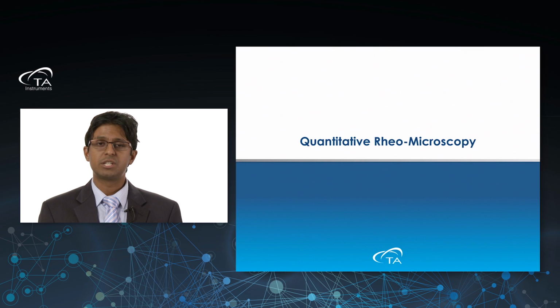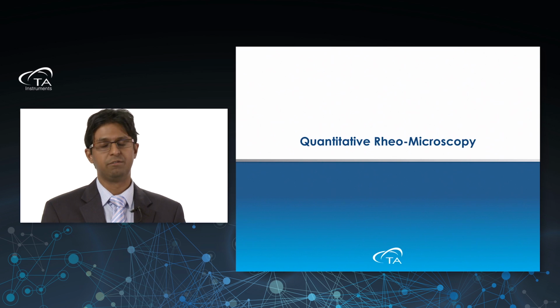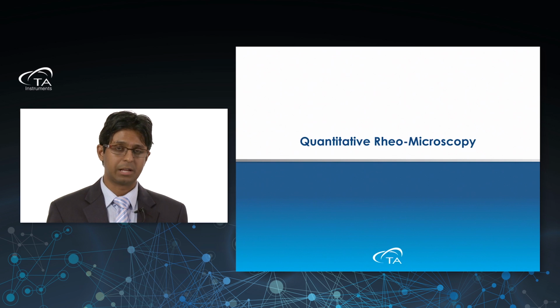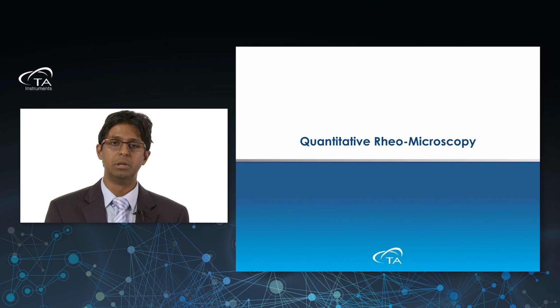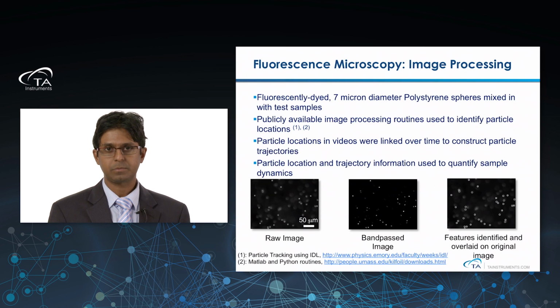In the last section of this talk, I'll talk about how we could do quantitative rheomicroscopy. So previously I showed examples of collecting pictures and videos during rheological tests that can be used to gain qualitative insights. So we notice that the lipid domain is increasing in size, or we're seeing the elongation and breakup of emulsion droplets. In this case, we'll go one step further and analyze the videos that we're collecting.